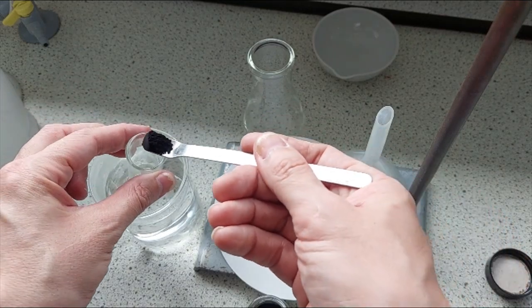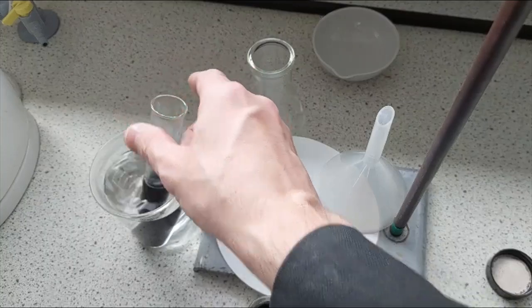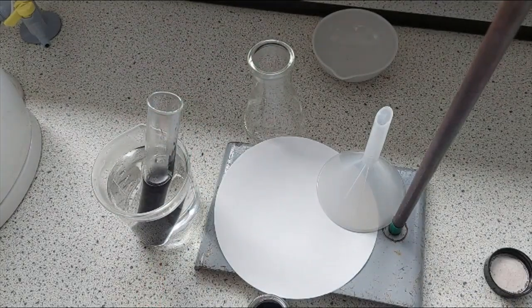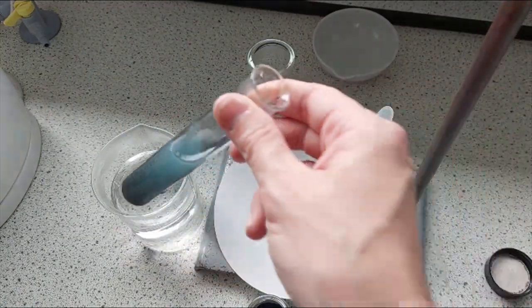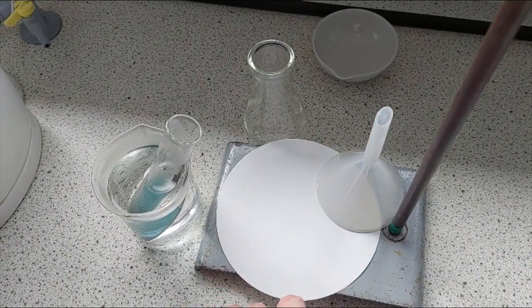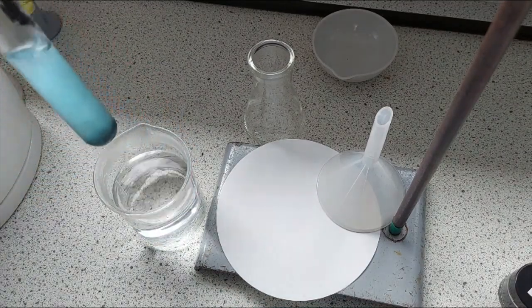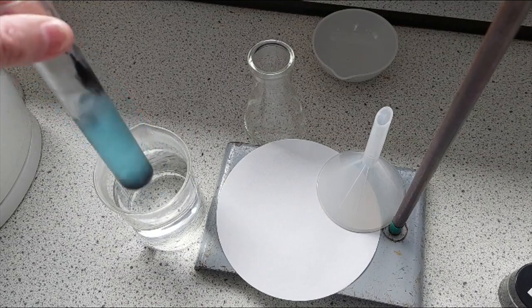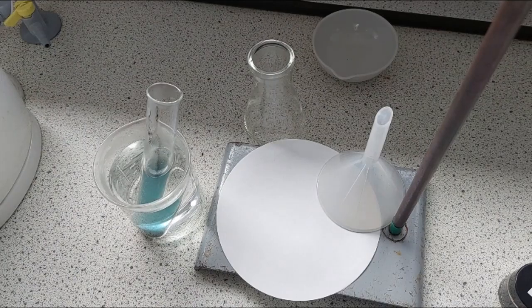So when this reacts, there will be quite an obvious color change. You can see a black powder. At the moment it's floating around in that sulfuric acid. If you look very closely, you'll see it's beginning to change colour. Now that colour change is caused by the salt which is being formed, and you can see now all the black colour has pretty much vanished. There's a little bit at the bottom there, so I'm going to give it a little shake, get that to mix up a bit more, but that blue colour, the salt that's being formed, is known as copper sulfate.